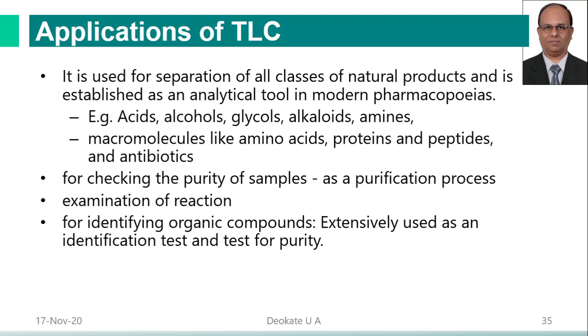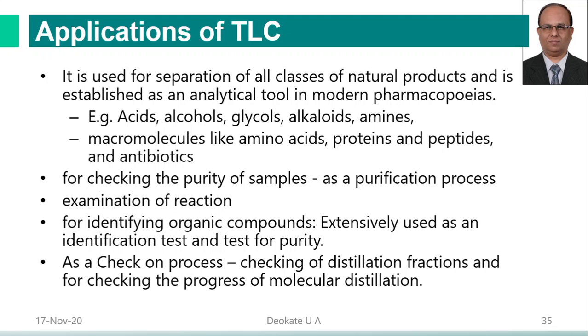For identifying organic compounds, it is extensively used as an identification test and test for purity. As a check on the process, checking of distillation fractions, and for checking the progress of molecular distillation, TLC is a choice.